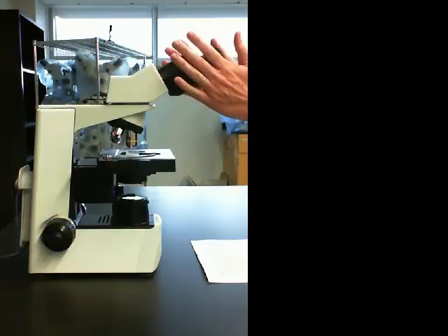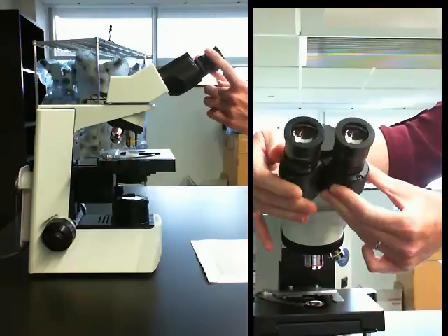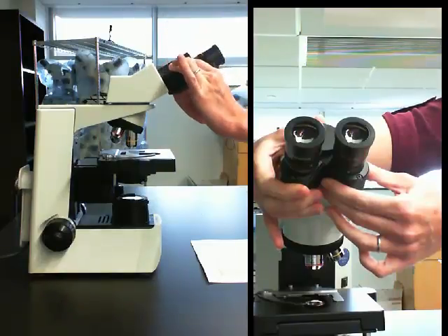We should make sure that these oculars are set for our eyes. Binocular microscopes and stereo microscopes have one ocular lens that is adjustable. This enables you to adjust the viewing for your eyes so that you don't need to wear your glasses, for example. First, you're going to find your specimen under scanning power and adjust the focus with the coarse knob. Then you're going to adjust the interpupillary distance until it is correct for you. This is the distance between the pupils of your eyes, or in this case you could think of it as just your eyes themselves. And so you're going to be able to move these back and forth.